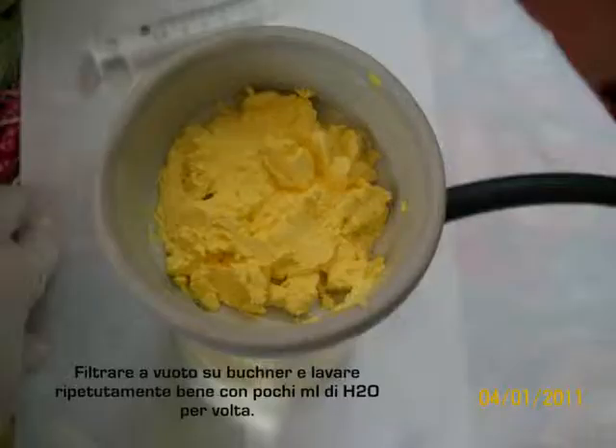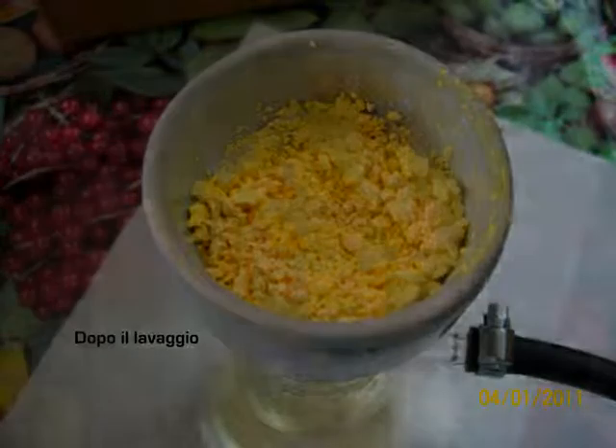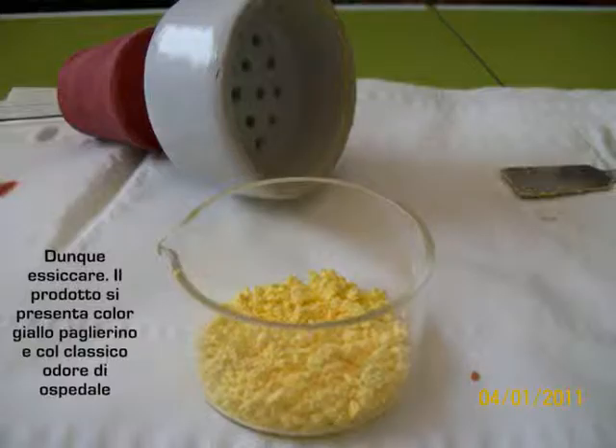Filter on a Büchner funnel and wash it repeatedly with a few ml of water at a time. After washing, dry. The product is a very yellow color with the classic smell of a hospital.